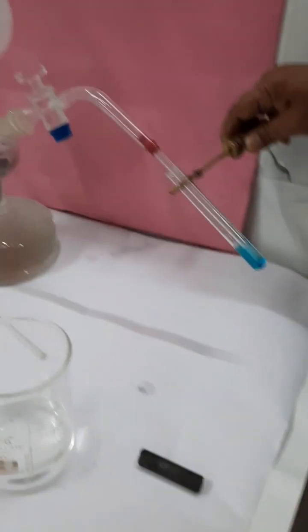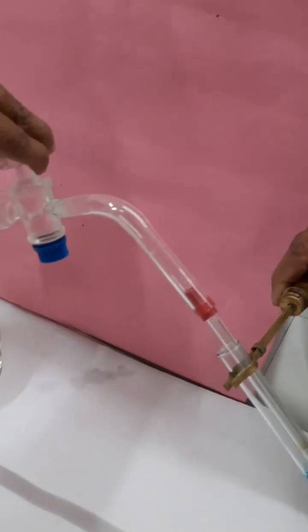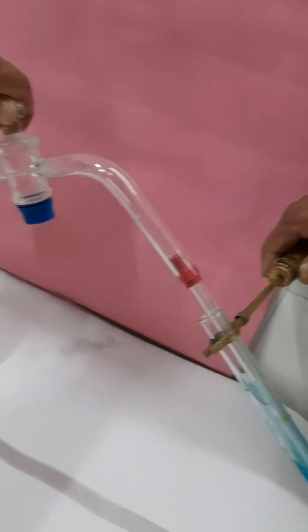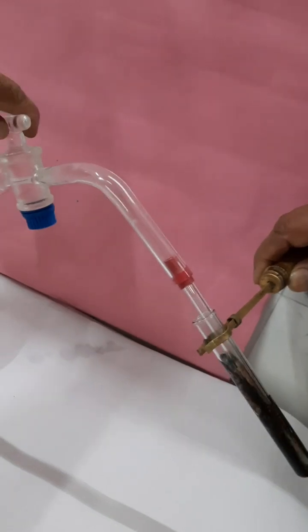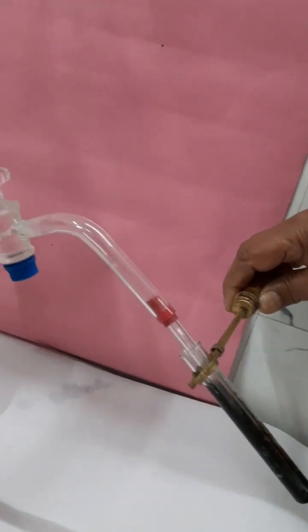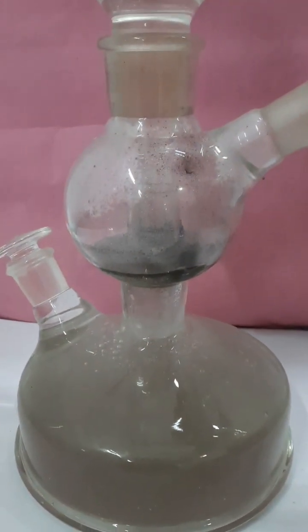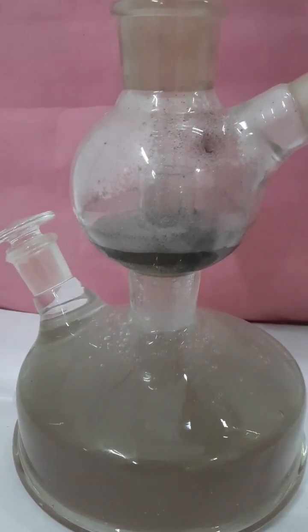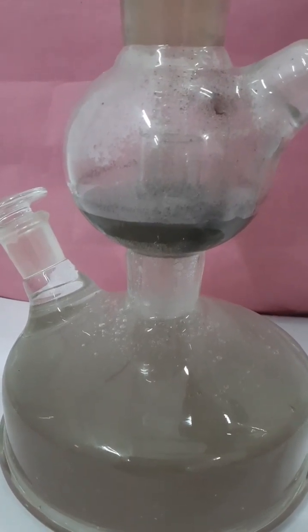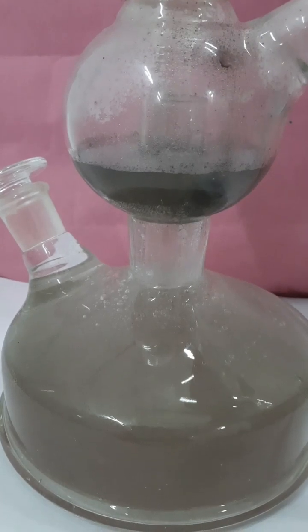Now the gas has been prepared in the middle chamber and all the sulfuric acid has been pressed into the third chamber. I am opening the knob and passing H₂S gas into the copper sulfate solution. The copper sulfate solution turns black due to the formation of copper sulfide. Again, dilute sulfuric acid starts rising into the middle chamber as the gas is released, and the reaction starts again.